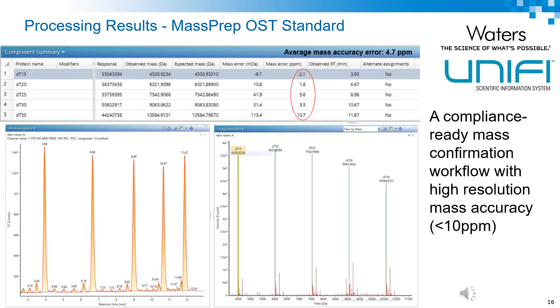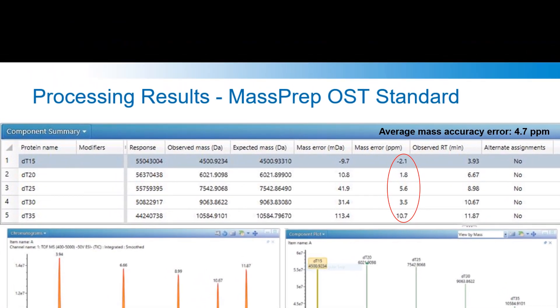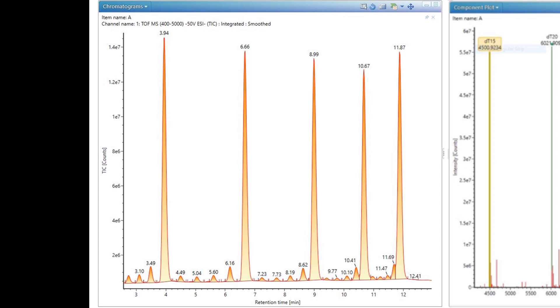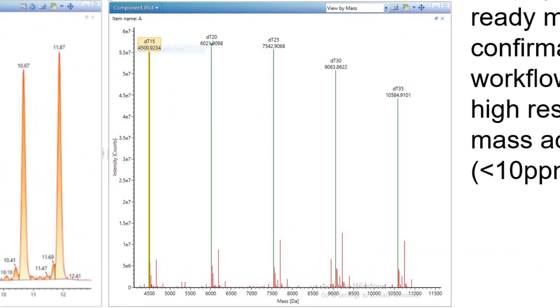Once the data is acquired, we have three very simple views that tell us how the experiment has gone. First of all, we have the measured masses which are being compared to the expected masses. You can see here that we're getting about 4.7 ppm mass accuracy, so this is a high mass accuracy machine. The industry standard for this sort of analysis is about 10 ppm, so this comes well within what we would hope for. We get a window that shows us the retention times, which we discussed earlier show the oligonucleotide length. And we also get a deconvoluted mass spectrum of everything that was in that run, and you can see where it's been labeled by the expected masses that we put in and the identities that we assigned. So everything that we expected to see shows up in green.